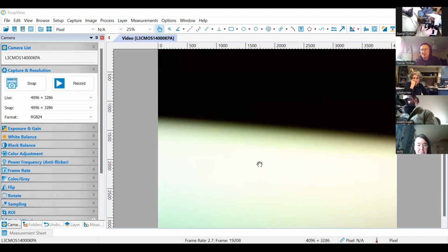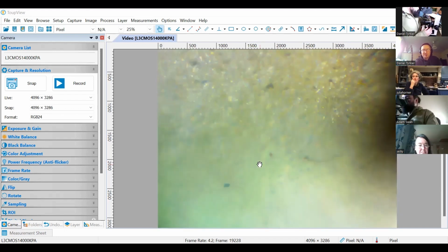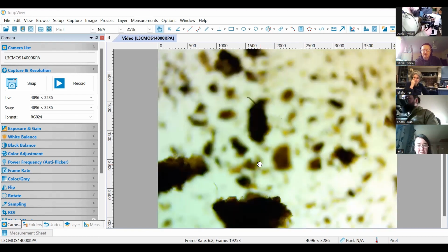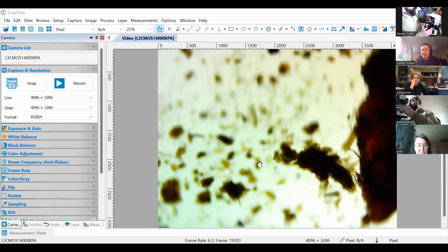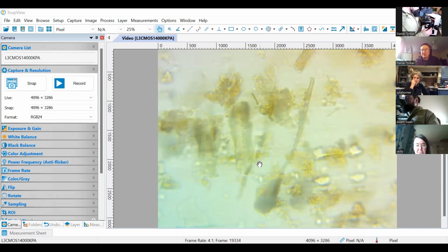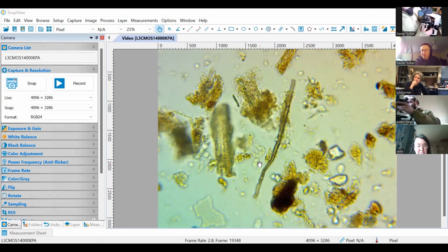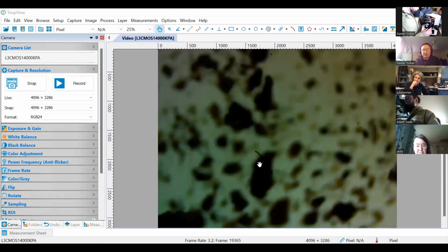In the meantime, Katie asked about replicates for nematode accuracy. In science, most scientists will tell you to do 3 replicates for standard deviation for them to be happy. So if you're counting nematodes and you want accuracy, you need 3 replicates, so 3 drops. You seem to imply from your wording that for all the other microorganisms, you would be content using only a single drop. And normally, yes, as well.